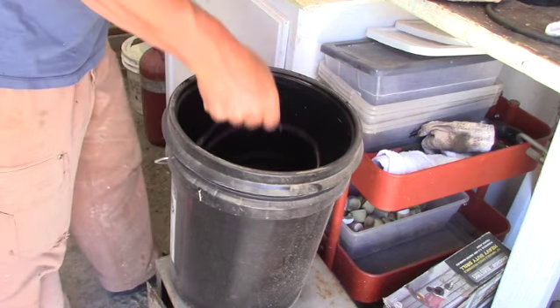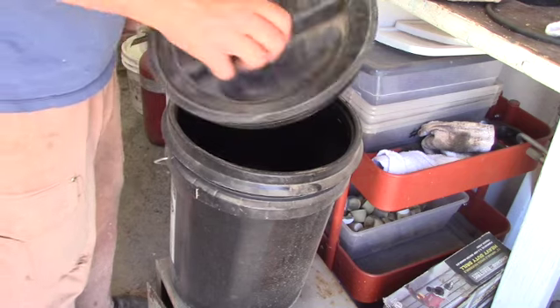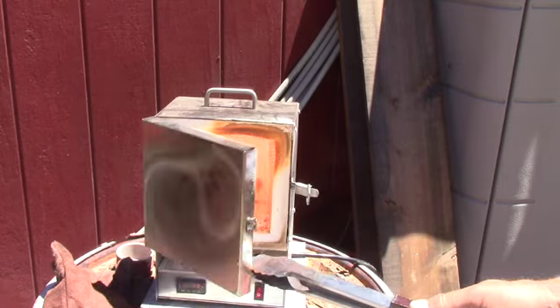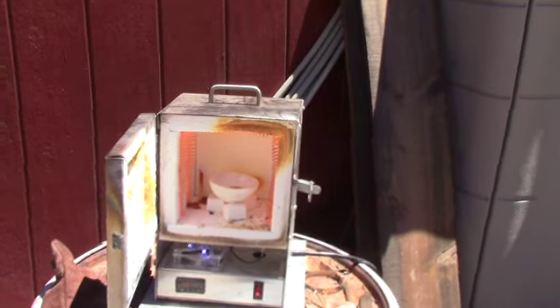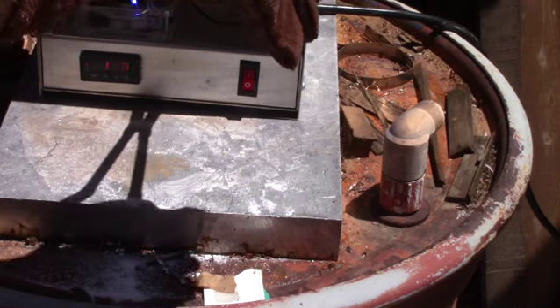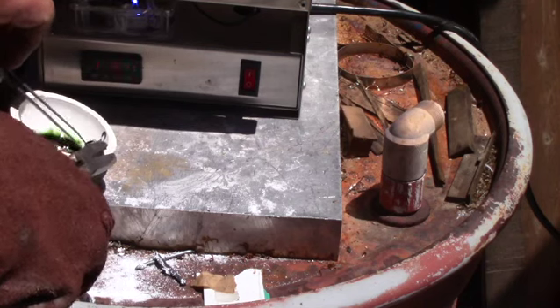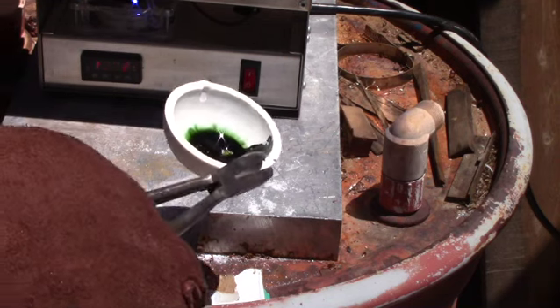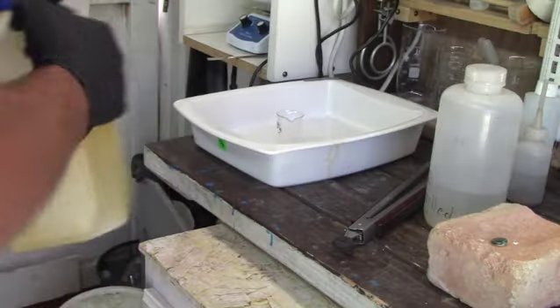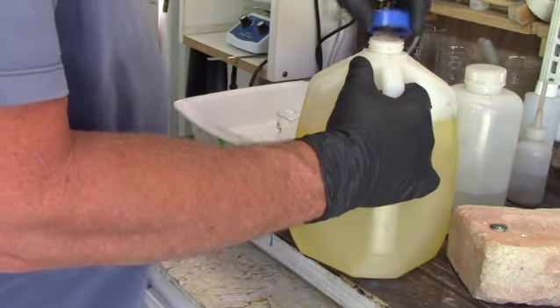You might ask what I do with the remnants of my experiments — this is my stock pot. Any waste material from silver processing goes in here and will be treated over a long period of time. There's a coil of copper in here which will condense out any silver that's still in solution. Then we will put iron in with the nitric acid to pull out any copper, and then dispose of the solution in proper hazmat form.